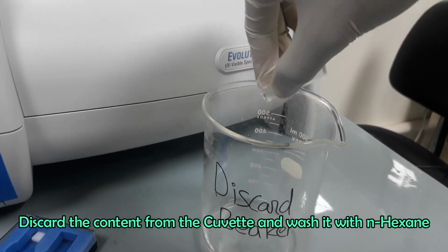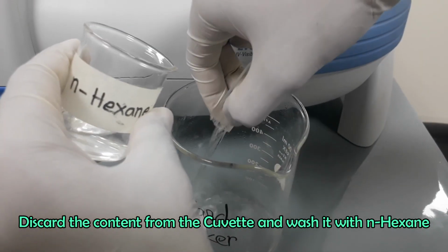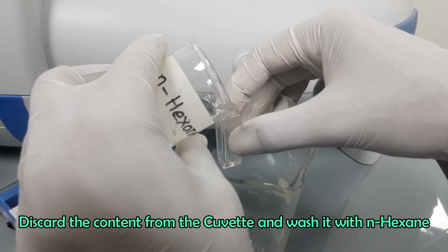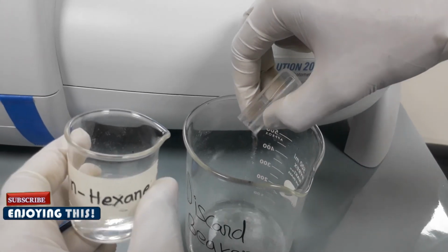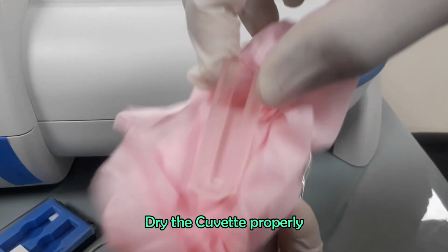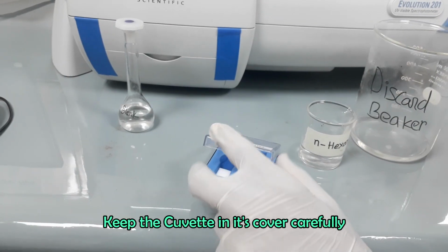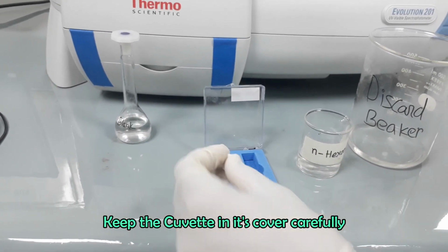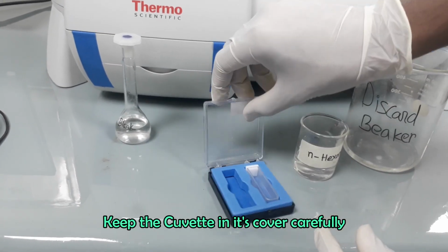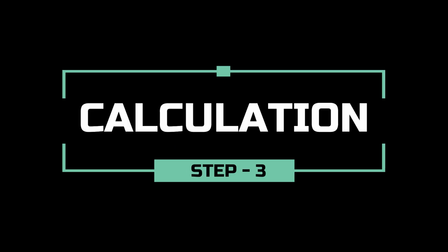Discard the content from the cuvette and wash it with n-hexane. Dry the cuvette properly. Keep the cuvette in its cover carefully. Now we will calculate the vitamin A concentration.